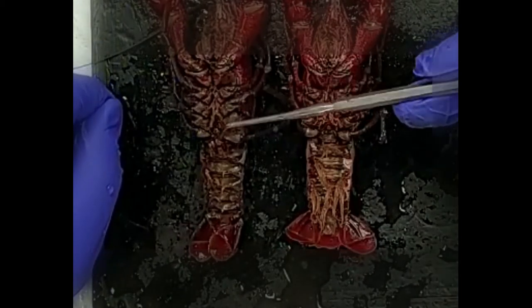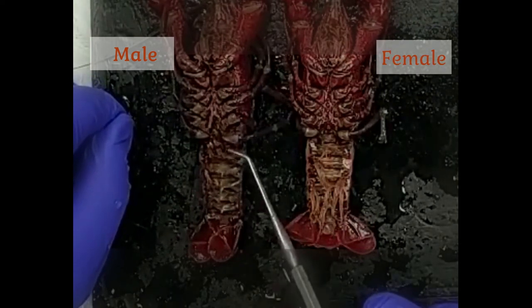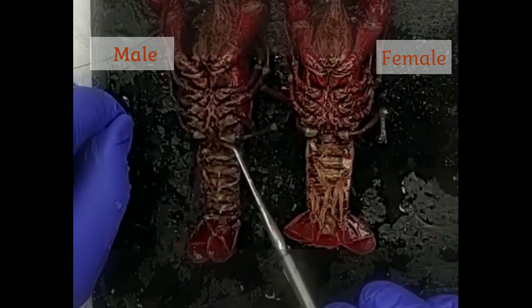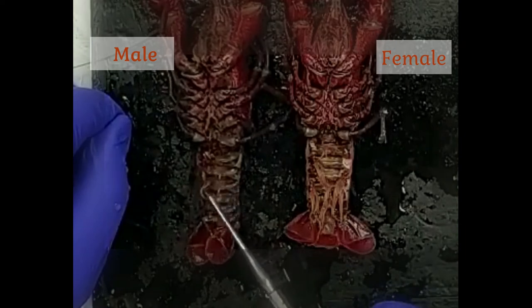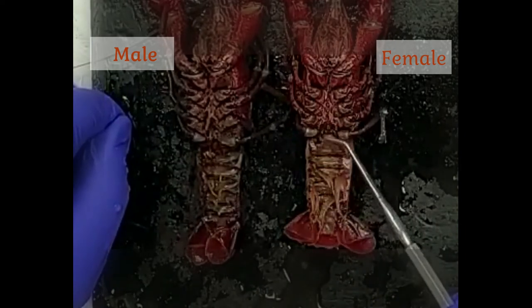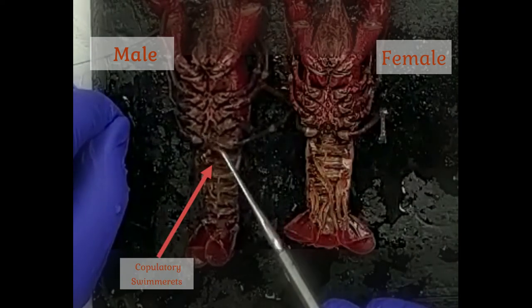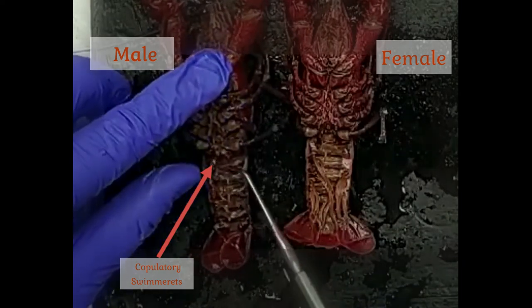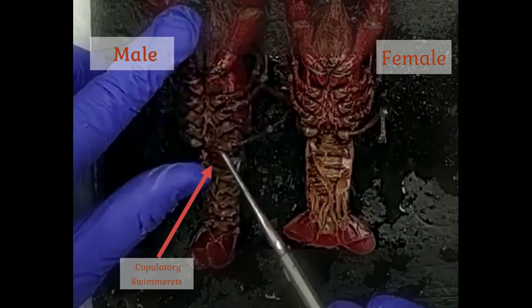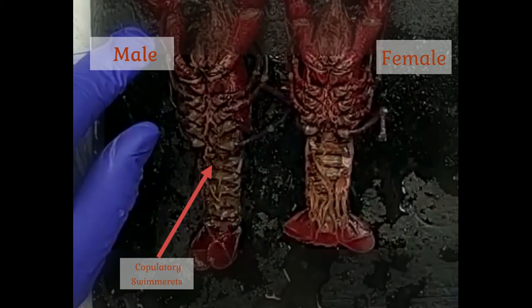Here we have two crayfish — one male and one female — both ventral side up. The male is on the left and the female is on the right. The way we can tell the difference is by looking at the swimmerettes, which are the appendages attached to the ventral side of the abdomen. In the female, all swimmerettes are feathery. In the male, the first two pairs of swimmerettes are sclerotized — hardened for use as copulatory swimmerettes used during mating for the transfer of sperm.